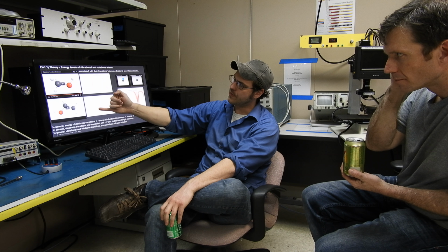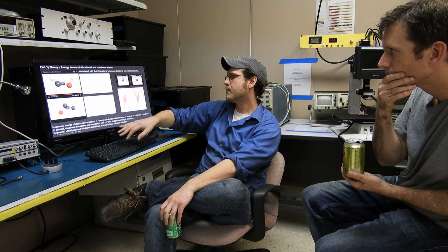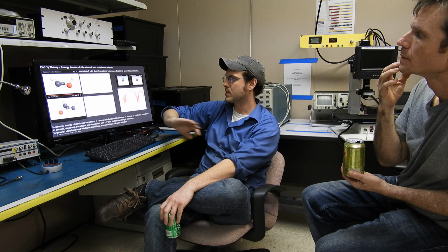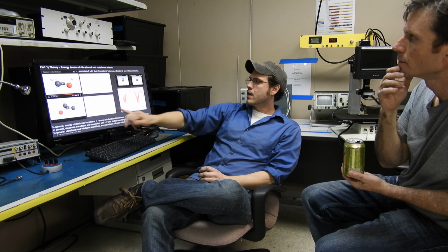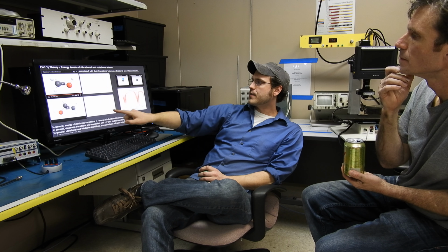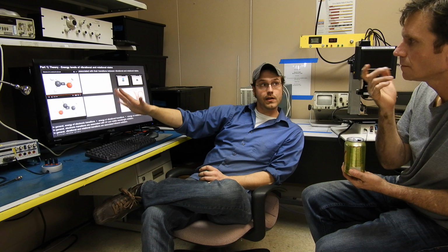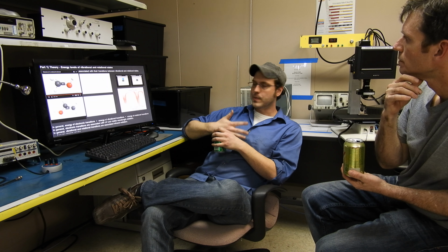What I was saying with resolution, if we zero in on this peak here, you see how it's got that kind of pointed second peak there? Mm-hmm. If you have an extremely low-resolution spectrometer, you wouldn't be able to distinguish these peaks. It would just appear as one. You might see a shoulder feature or something, but you're not sure it's there. Sure. So that's why you have to have high spectral resolution.